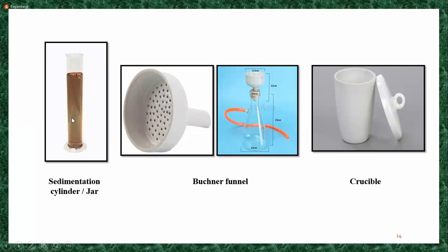Here you can observe the vacuum setup. What is the purpose of this vacuum setup?